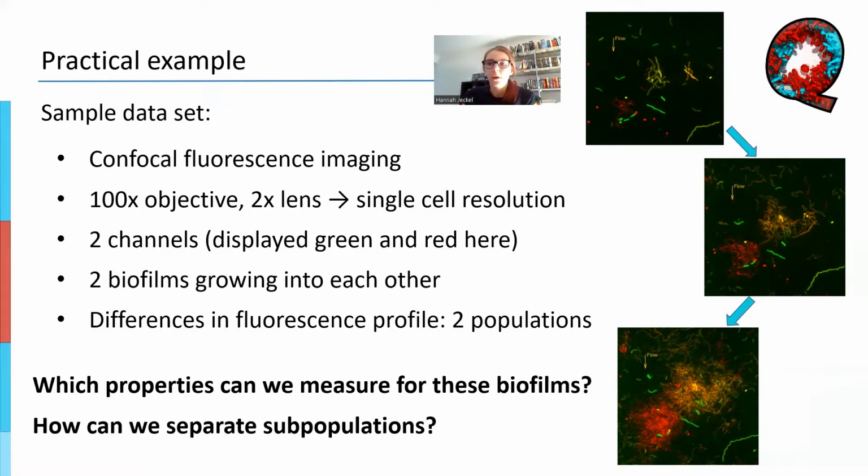And this workflow is a quick compilation of many of the tutorials that we already have on YouTube. So it's a bit of a quick start. If you want to learn more about some of the processes that we do in detail, that I'm going through a little bit too fast, in your opinion, you can always check out the tutorials and go back to them. So this is just to give you a very brief, but hopefully somewhat comprehensive overview of what you can do with BiofilmQ with this one example.